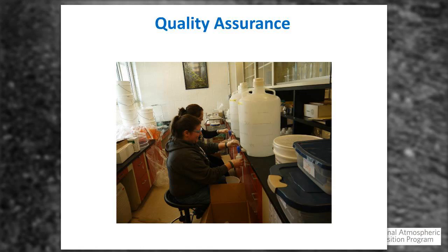Behind them, you'll see a stack of buckets and bags and lids and bottles. We pull randomly from the clean supplies and test them. We expose these to water. We test the water to ensure cleanliness. Again, this is why we clean all the supplies. If you had to do that at your site, you would have to be doing similar quality assurance. It's really very high-level quality we do to ensure the cleanliness of all of our supplies, because we just need that for the long-term trends we're measuring. Little bits of dirt, little bits of contamination will greatly affect the overall sample chemistry.